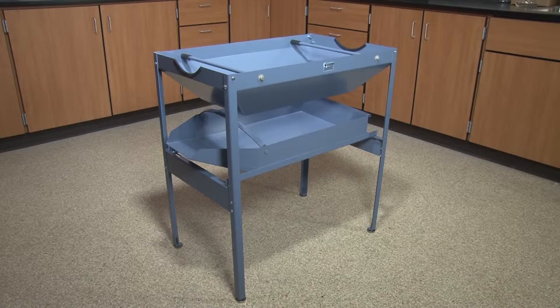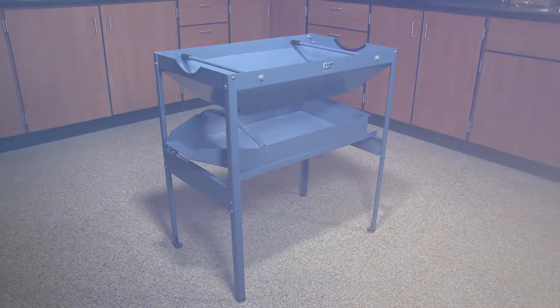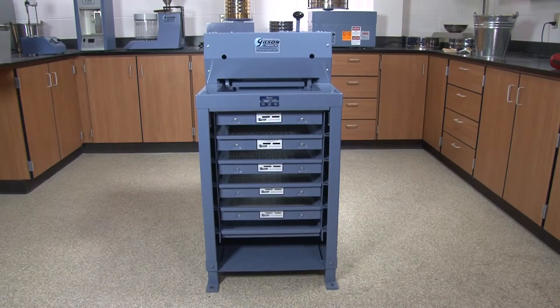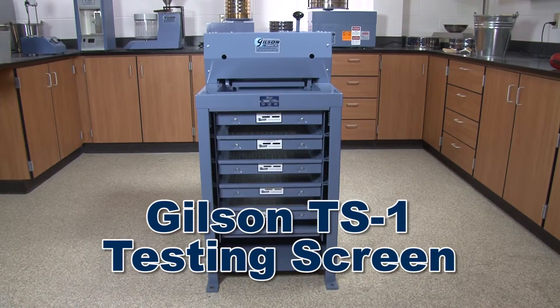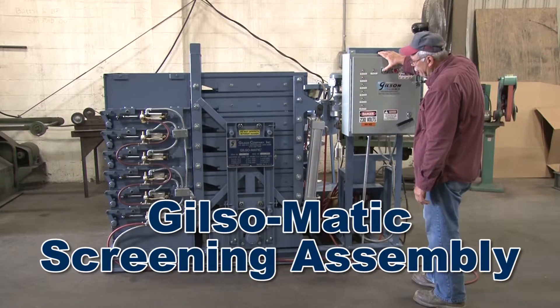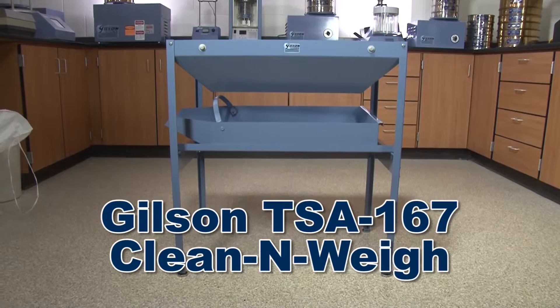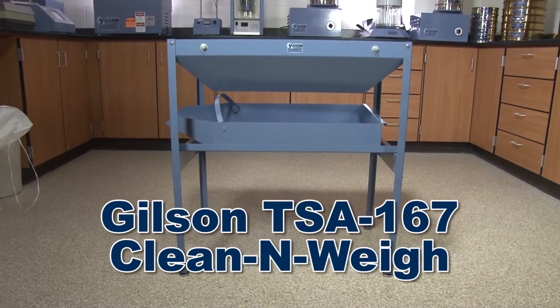The Clean & Weigh accessory is also a great tool to aid in cleaning your screen trays. From the industry gold standard Gilson TS1 testing screen to the automated in-plant Gilsonmatic screening assembly, Gilson has the right screening equipment to fit your particle size determination needs.